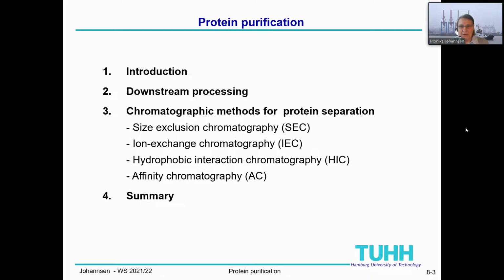We touched on that topic already a few times during your presentations, but I think it would be a good idea to have an overview of all the methods available for protein purification at one glance, and also to see that often a combination of these methods is necessary to reach the goals, in terms of purity and perhaps also of yield. So that's what we will go through in the next hour.